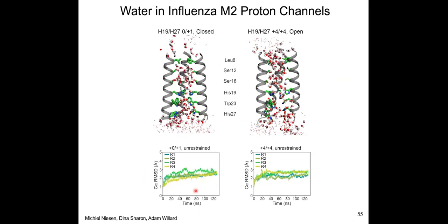And the last few slides will give you a slightly different take of water edited NMR. And here we're not only focusing on the amount of water next to protein residues, but also the dynamics or the nature of water molecules next to some residues. And we're doing this for the influenza B virus proton channel, which we solved the structure for. And then we collaborated with a group that does MD simulations that can tell us about, okay, what do these channels look like in the closed and open state in terms of the interior, the water permeated pore. So we did all these MD simulations.